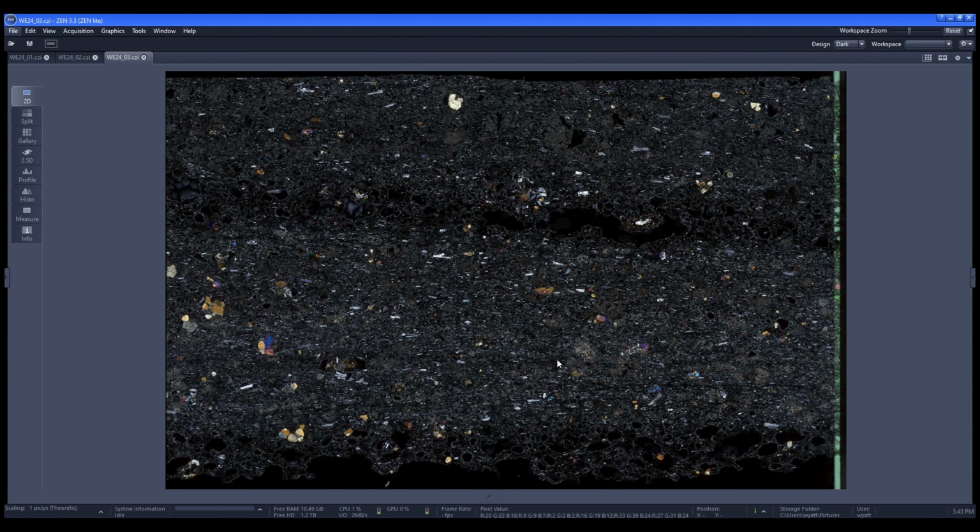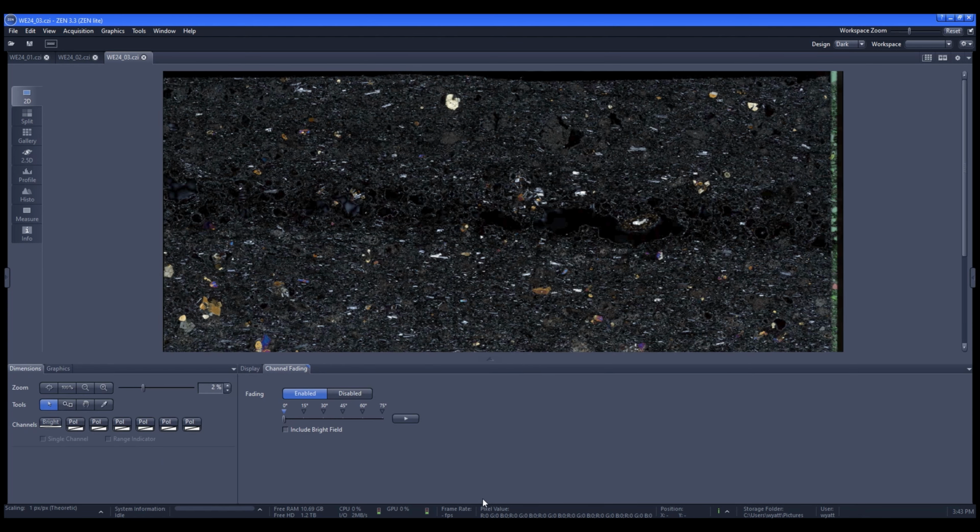So here is a very different looking sample, and this is again from Black Butte, but this is a bomb. This is a volcanic bomb, and this is a chunk of the magma that was thrown and ejected out of the volcano, went flying in the air, and came plopping down on the side of the vent. And because of that, it's super gas rich, and it cooled relatively quickly, unlike the last sample I just showed you.